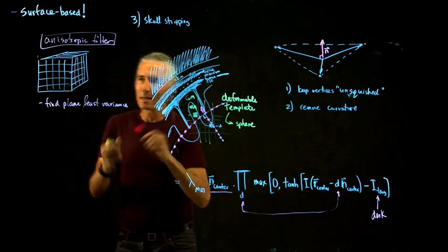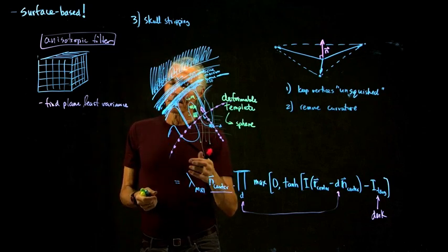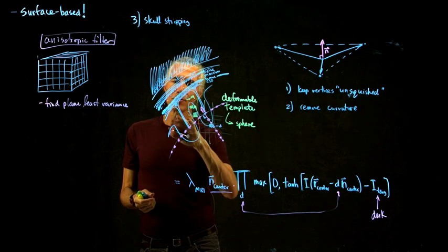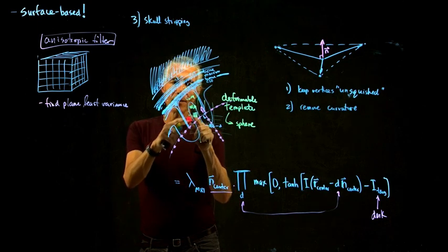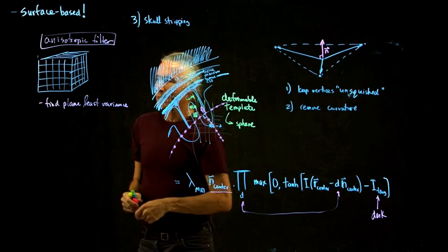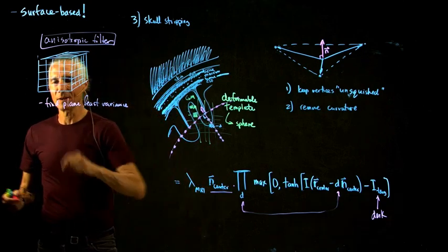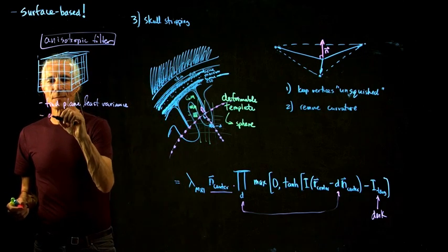So before I say this, why don't you just smooth the data? You can do that. If you smooth the data, you reduce the resolution of the data set a lot. You could get rid of this bad voxel if you just smooth it in 3D. This is basically a way of less smoothing. So find a plane of least variance and then only smoothen that plane.